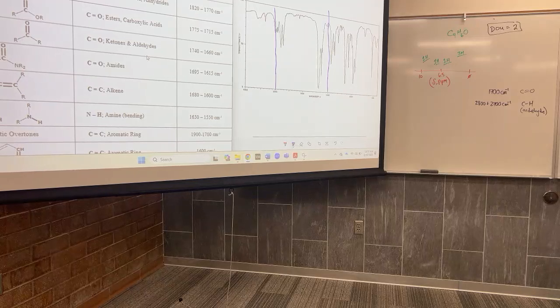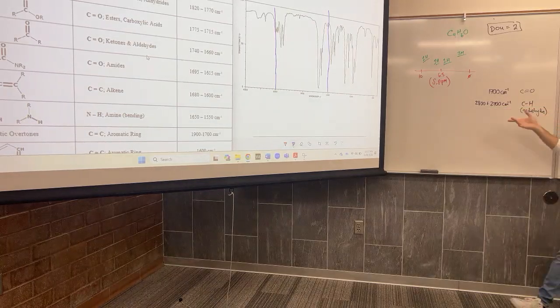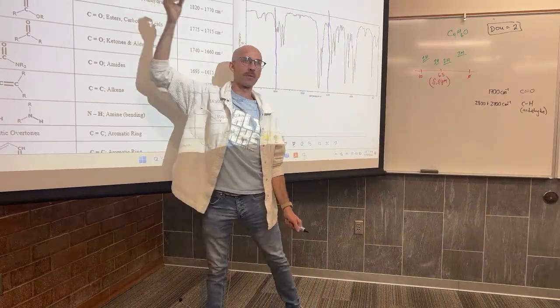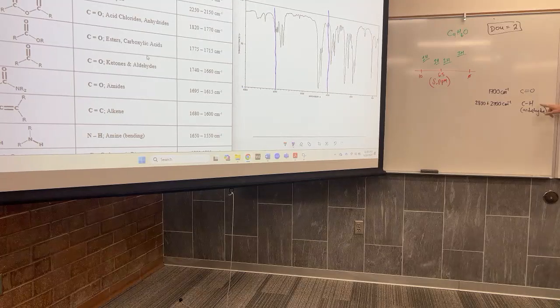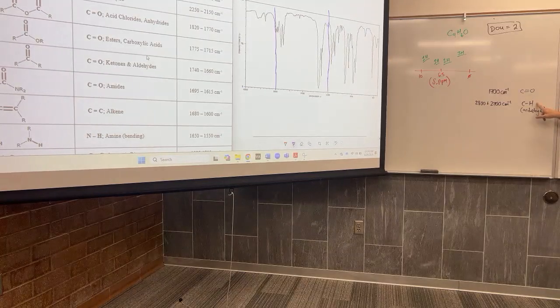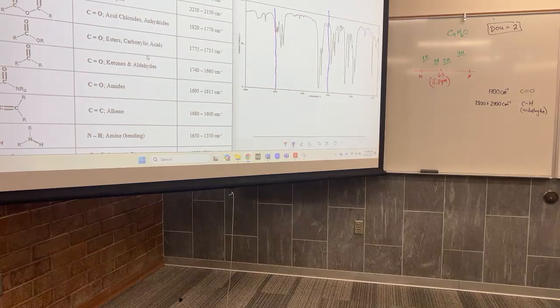Listen, I understand that you guys are going to be answering these questions using my correlation table. So you addressing that the signal at 2800 and 2700 tells me an aldehyde. I know that you can read that it's a CH, but remember that you are listing the bond type. Aldehyde is not a bond type. Aldehyde is a grouping of bonds. This absorption comes from the bond type CH, but not just any CH, the CH of the aldehyde. Okay, well, that makes me feel a lot more confident that this is the CO double bond of the aldehyde. Although if you just put CO double bond there, I would accept it because, again, the only thing that confirms it is the corresponding peak here.